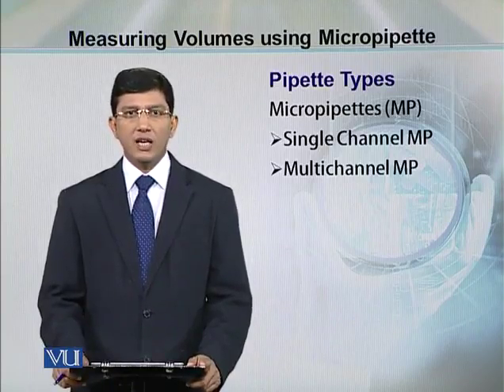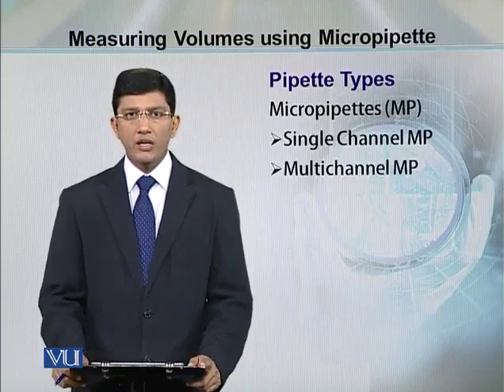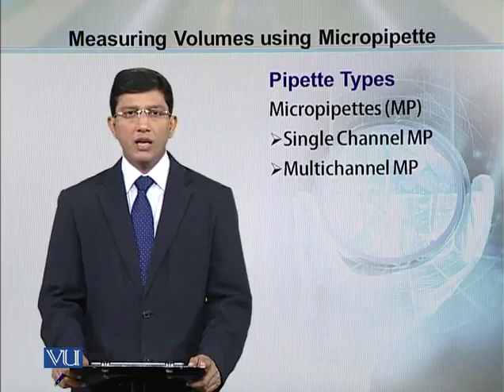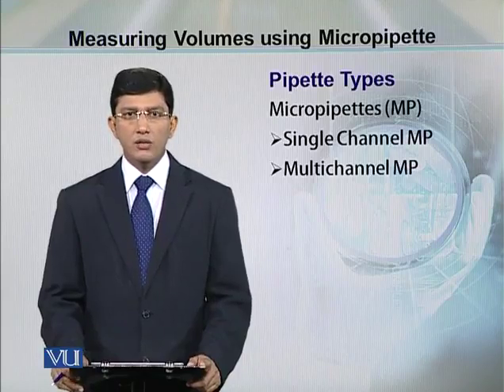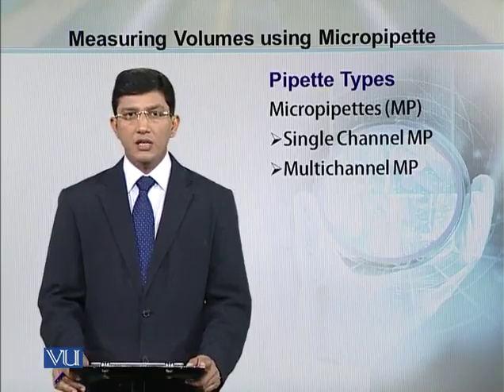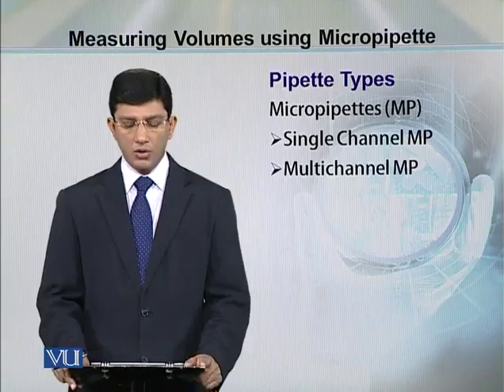The only difference is that in single channel micropipette, you can take one sample or one measurement at a time. In multi-channel micropipette, you can have more than one sample but equal volumes in different channels at a time. We will see this difference in our next module.